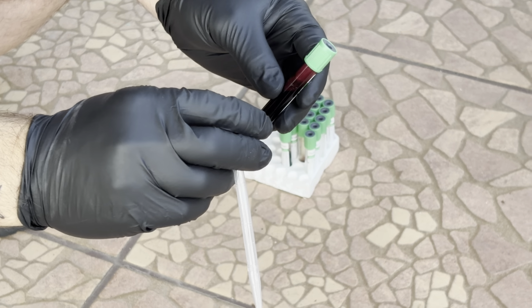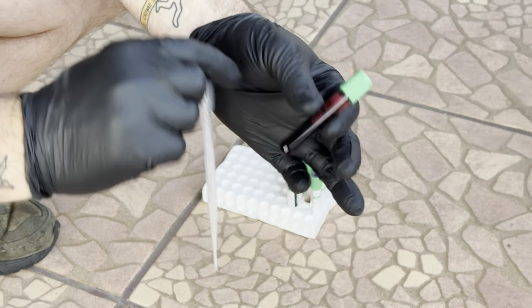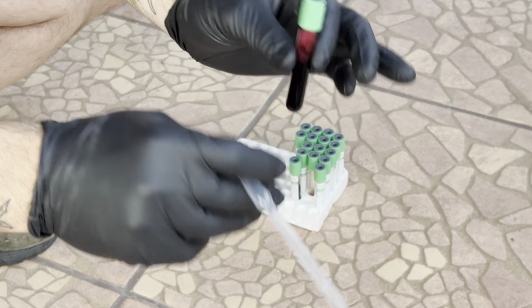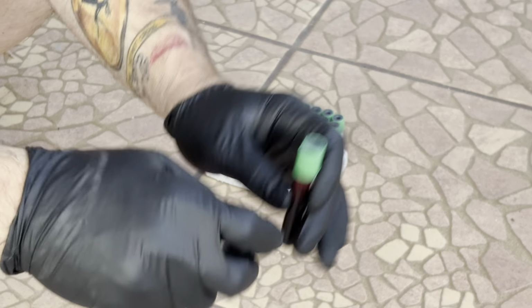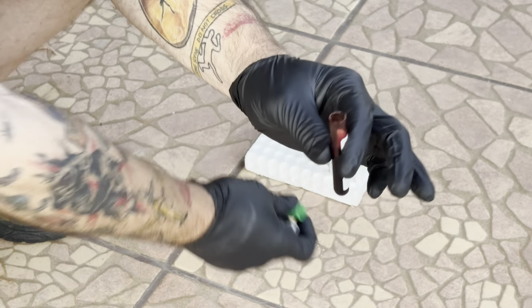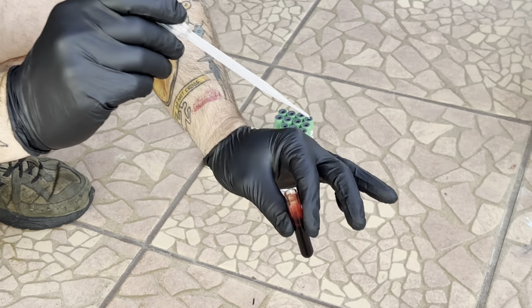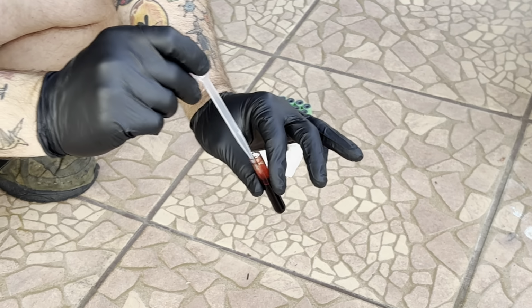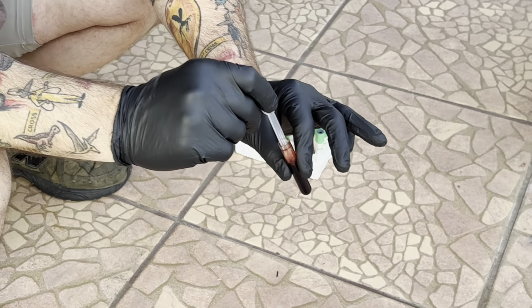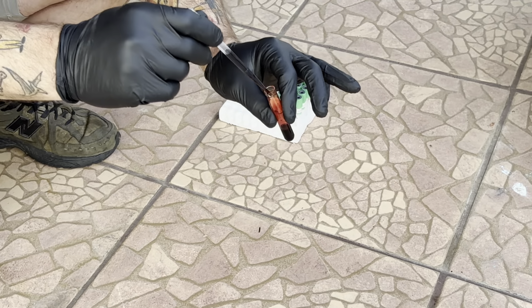Yes. Ready? This is Jeffrey Gentry, BPA, Bloodstain Pattern Analyst. Today I'm going to be doing a few drip stains with my own blood. I've had this for quite a while, so it's probably going to smell a lot, but it's good for doing experiments. And I like to use my own blood for experiments just so you can see what actual real blood looks like, so there's no doubt in your mind what real blood is going to look like at a scene.